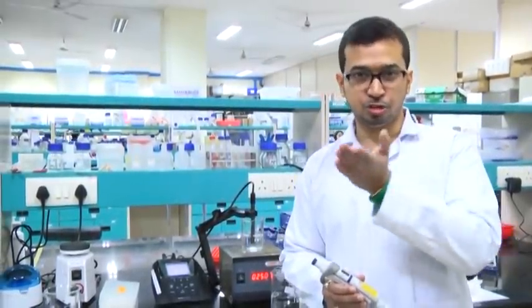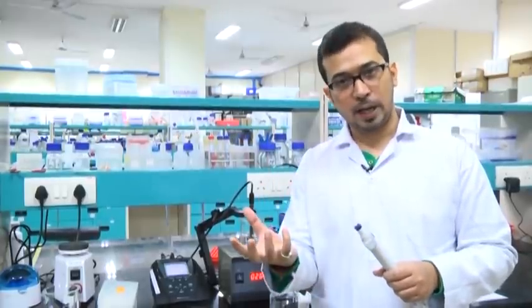Unlike the Tris preparation where individual component concentration cannot be precisely determined, here we can consider the concentration of each component — monobasic and dibasic. Phosphate buffer pH may range from 6 to 8. The component we take in the beaker should be the solution whose pH is nearest to the desired pH — it will have the maximum volume.